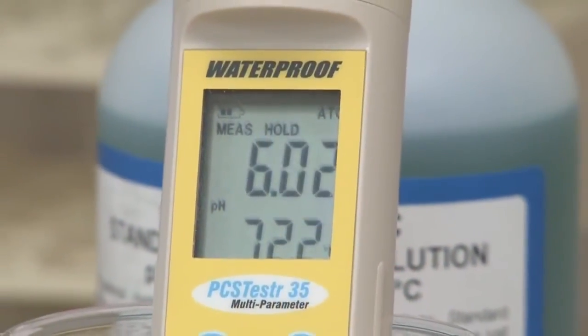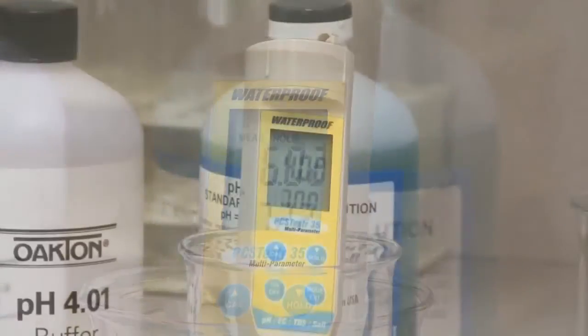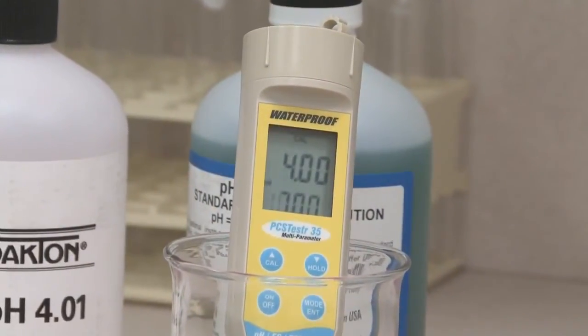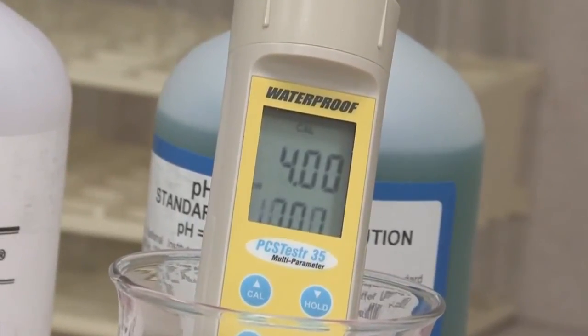View measurements on the large, easy-to-see liquid crystal display. For higher accuracies, read up to 5-point pH or up to 3-point conductivity and TDS calibrations.